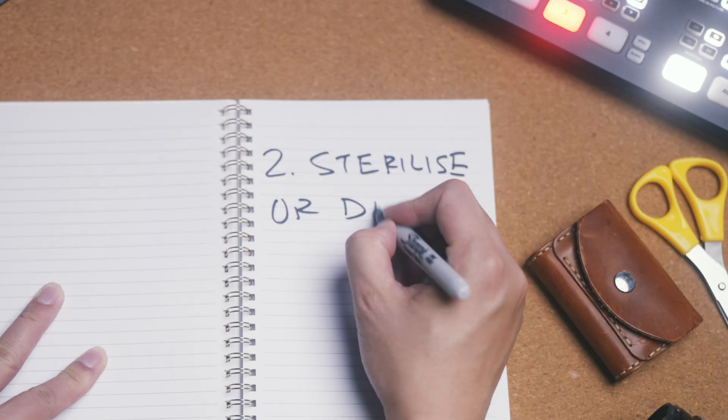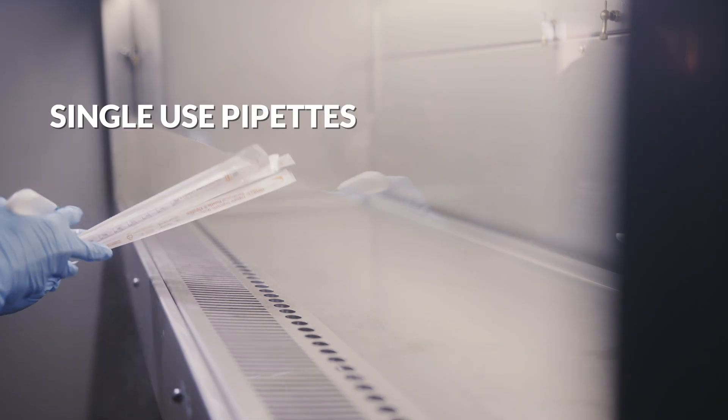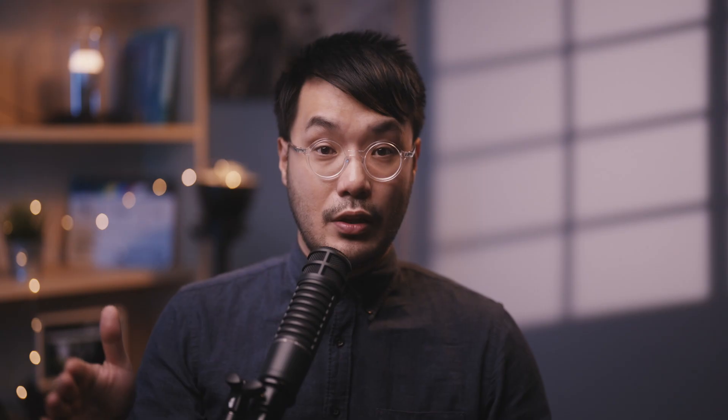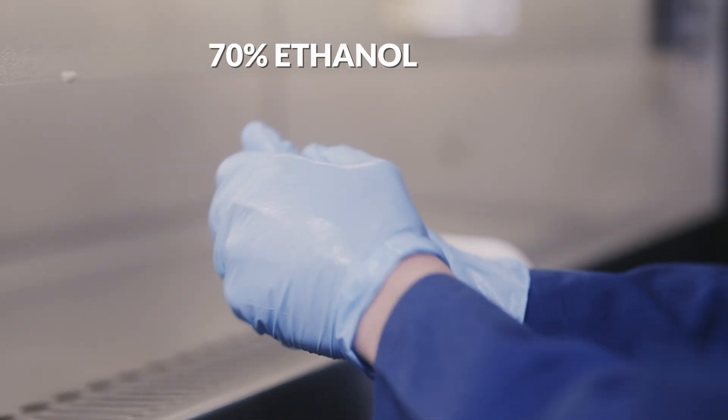Second, everything that goes into the hood needs to be sterilized or disinfected. Ideally, you're working with single-use items that have been pre-sterilized. Everything else that cannot be sterilized with either high temperatures or harsh chemicals — for example, your hands — is disinfected with 70% ethanol.